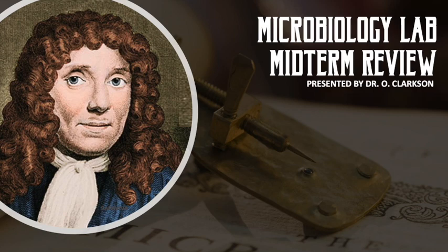How do you fix a slide when you're preparing a smear from a solid medium? We've done that several times this semester, so you know it off the top of your head. Like heat fixing? Yeah, so what's the first step? You get the slide, right? What do you have to put on the slide first? Do you put the bacteria directly on the slide? Yeah, you put water on the slide, and you use a sterile inoculation loop to mix that bacteria in there, and then you do what? Do you heat fix it right away? No. You let it air dry, and then you do the heat fixing.